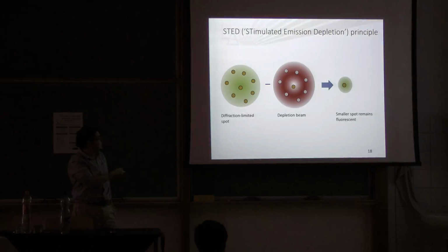But if you can do it, then the STED, or stimulated emission depletion principle, is this one. Here's your diffraction-limited spot of laser light.